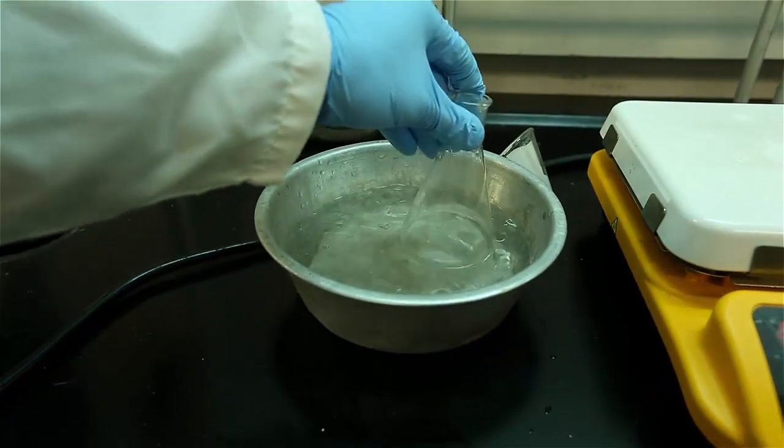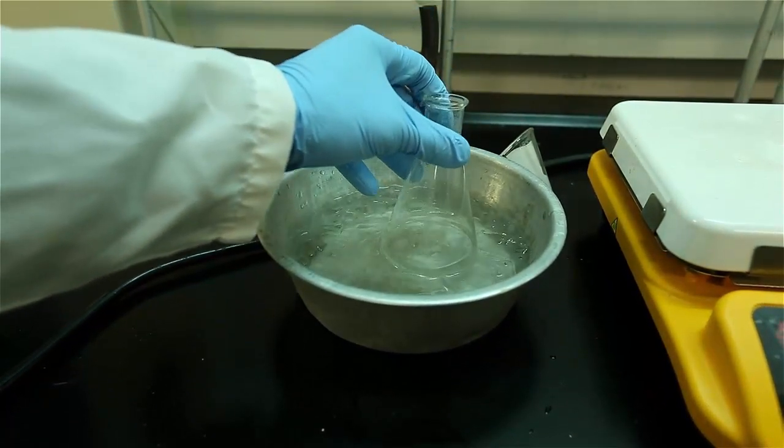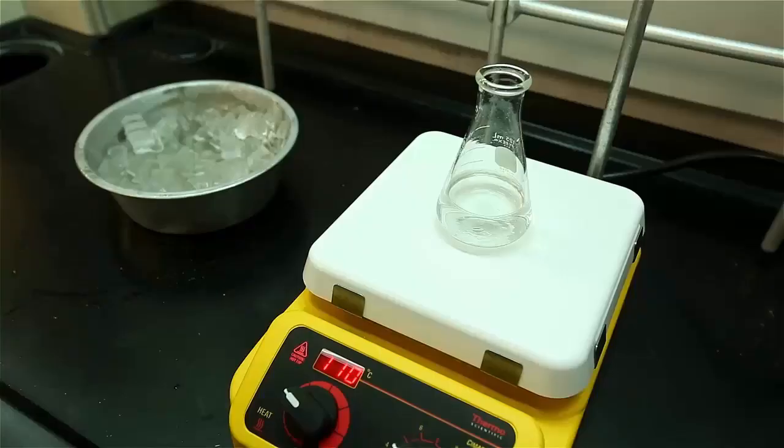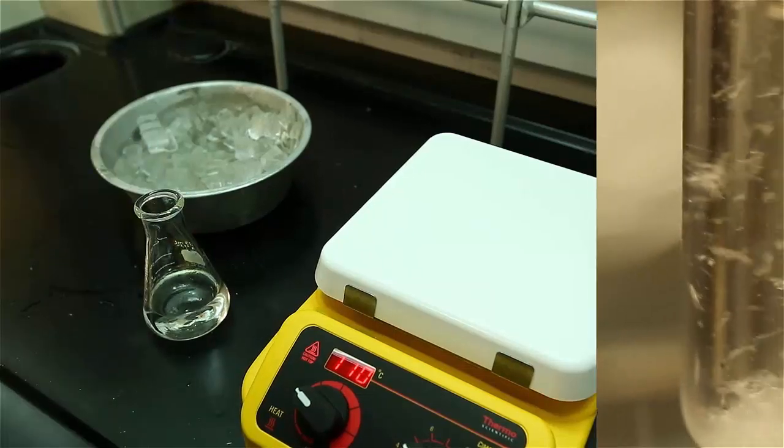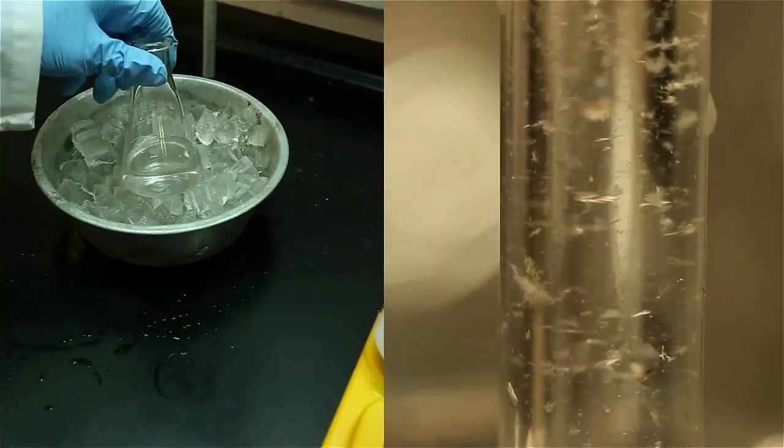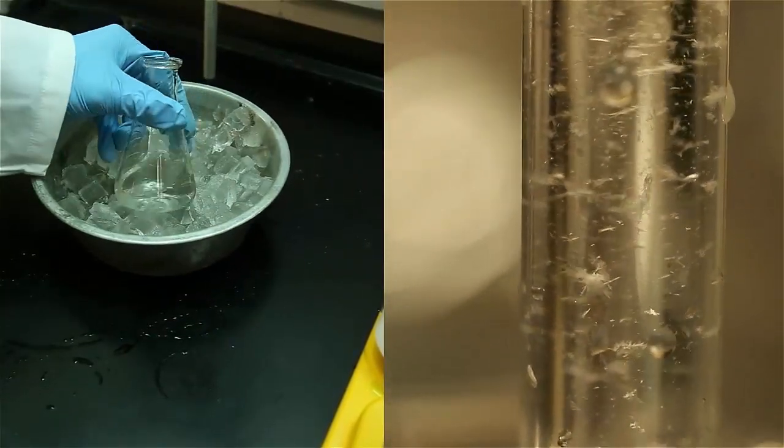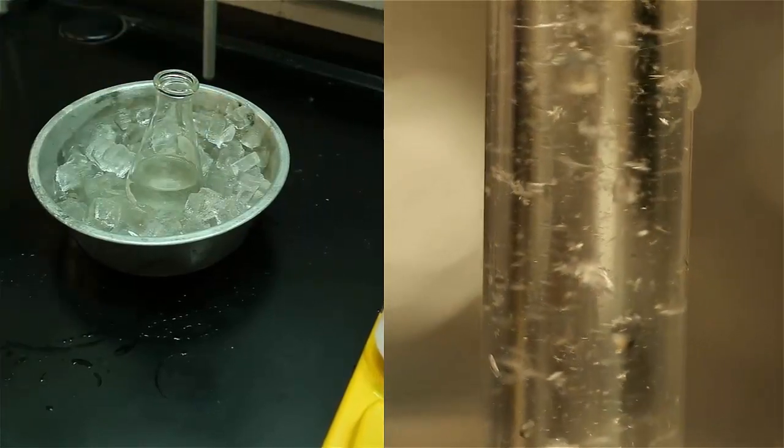The crystallization process determines the quality of your product. If the solution is rapidly immersed in an ice bath before allowed to cool to room temperature, small crystals will form, and small crystals are undesirable because of their large surface area and thus likely to retain impurities.